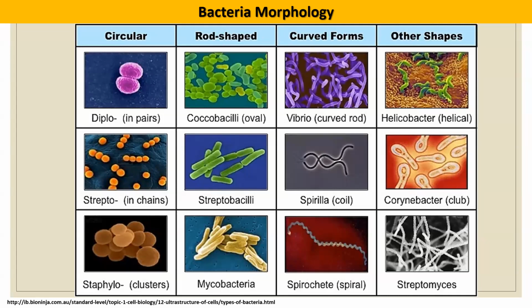Apart from observing the bacteria macroscopically, using our naked eye to observe its colony appearance, microscopic observation is very important for identification of the bacteria as well. Microscopic study is the first step in identifying bacteria, which can be divided into two groups according to staining effect: gram-positive bacteria and gram-negative bacteria.